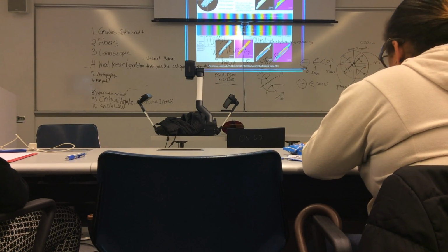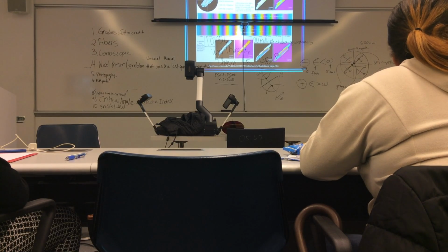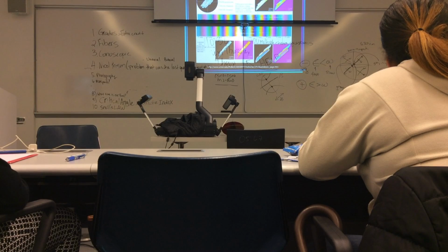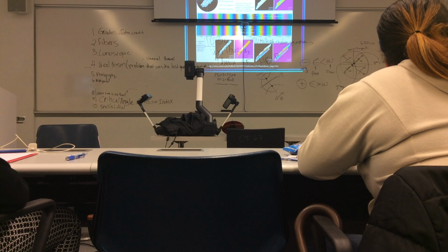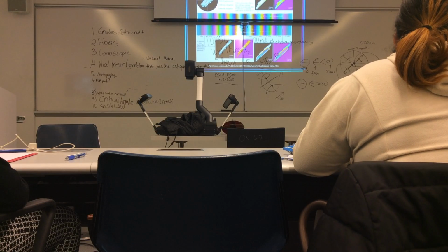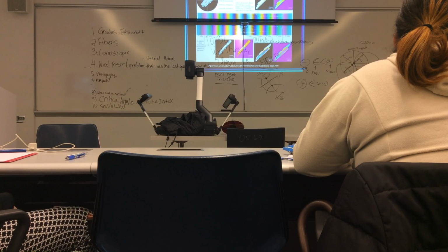Okay. So here is my biaxial interference figure. It's the negative optic sign in which I have my optic axes, which is the black lines. You can see those, the black lines. And it's an acute bisectrix figure because the acute angle is facing up and down. The direction that's cutting that acute angle in half is the shortest diameter on this indicatrix figure, and the shortest diameter represents the x direction in which alpha vibrates.